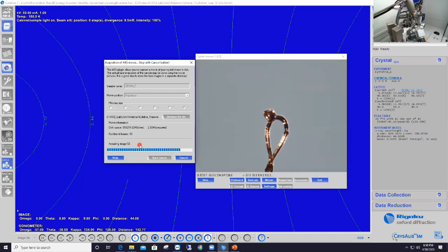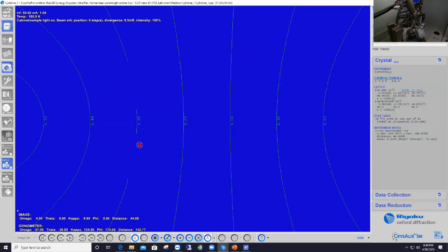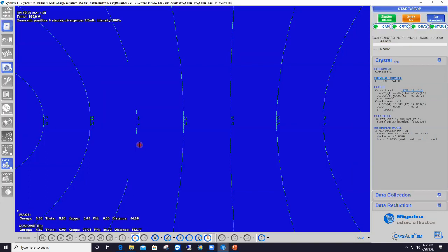Meanwhile, I can start taking some of your questions. So I'm sorry I went a bit long maybe. I gave quite a bit of detail, but I still have a bit of time to answer some of your questions. Hi, Pierre. So I answered a few questions during your talk.